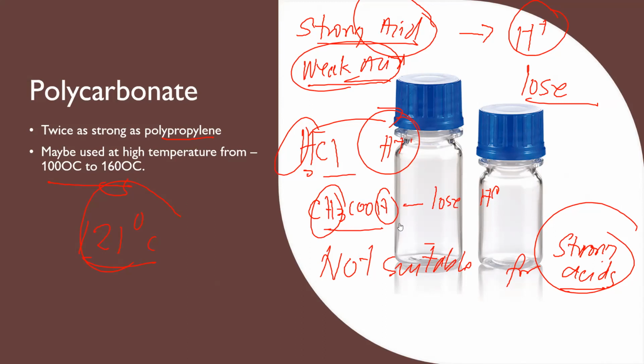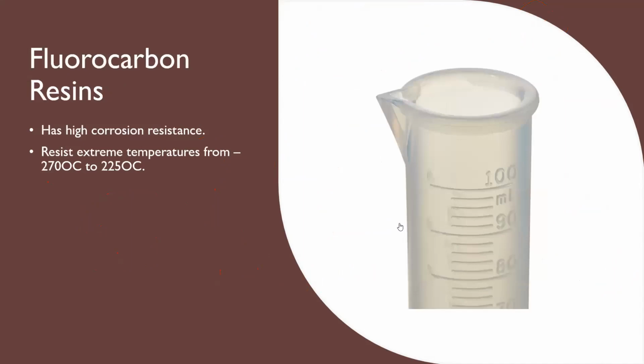Next is polycarbonate can also be used extensively in centrifugation. Next is we have your fluorocarbon resins. I guess this will be the last slide.